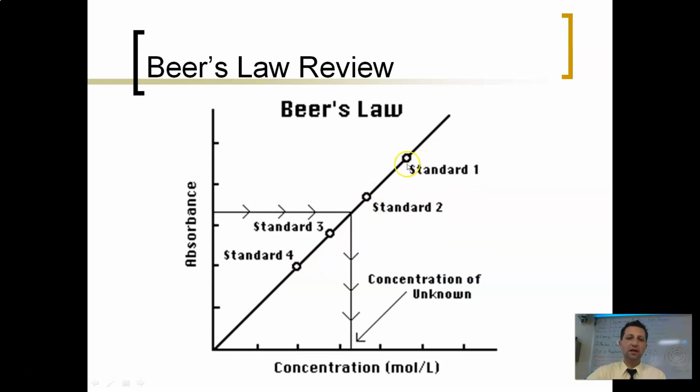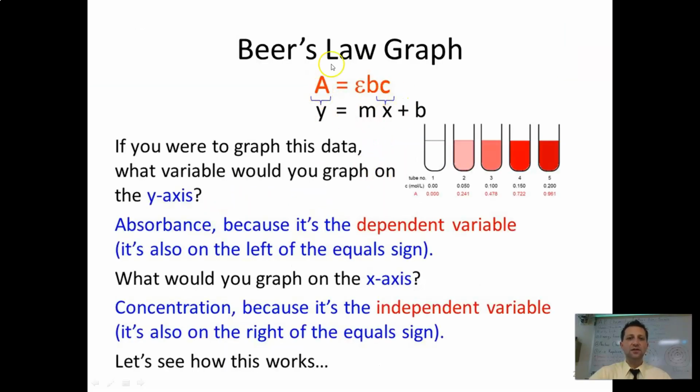What you'll do is you'll plot those 4 points. So I gave those to you in this lab, okay? If you're doing this lab during a different year where you made those yourselves, you would, again, just take your concentrations that you know of, your 0.4, 0.2, 0.1, 0.05, and then your absorbances from those, plot them. Hopefully you get a nice straight linear line with a good R-squared value. And you're going to have the computer figure out what is the formula for that best fit line for you. Okay? What you'll do then is take your absorbance, pop it into your best fit line equation, find your unknown concentration.